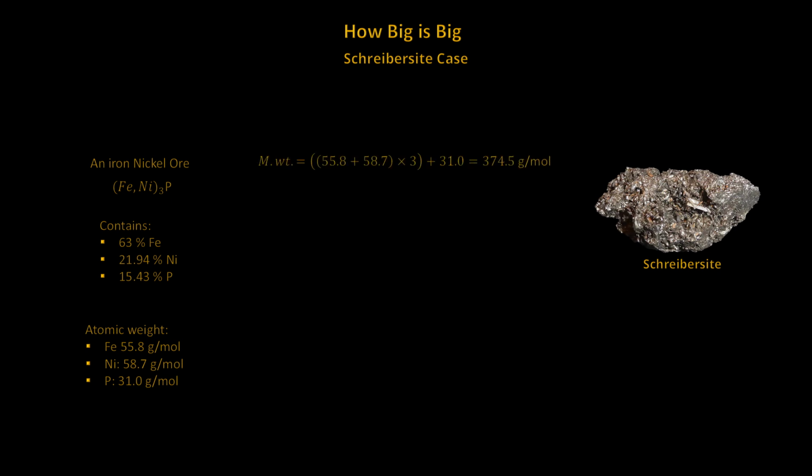In most cases, the mass of the precipitate that is easy to handle or manipulate is roughly 175 milligrams or 0.175 grams. The question now is how much sample mass is needed for a 175 milligram nickel precipitate. Well, the gravimetric factor is thus based on the nickel. Since the nickel is the product, the schreibersite becomes the sample, and thus the atomic weight of the nickel divided by the mass weight of the sample equates to 0.1567. This is the gravimetric factor.